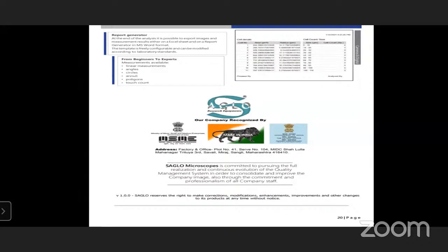Okay, so एक बाजूला एक उजव्या बाजूला एक मी रिपोर्ट दिलेला आहे, which is called as a cell count. So you get the report of individual cells according to this particular report. In this report you see एक तर cells आहेत 1 2 3 4 5 6 whatever the cells जे काही मेजर झाले त्याचा एरिया इन मायक्रोमीटर आहे आणि रेडियस इन मायक्रोमीटर आहे आणि त्याच्या बाजूला जे काय ते सेल डिस्ट्रीब्युशन्स आहे. म्हणजे 1 to 10 मध्ये किती सेल्स आहेत, 10 to 20 मध्ये किती आहेत, 20 to 30 मध्ये किती आहेत आणि असं अप टू 100 मायक्रॉन पर्यंतचे सेल्स किती आहेत त्याचं डिस्ट्रीब्युशन.